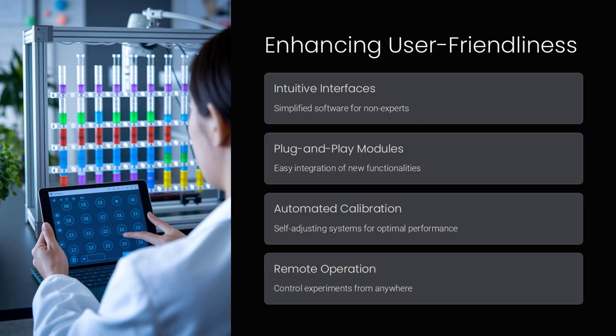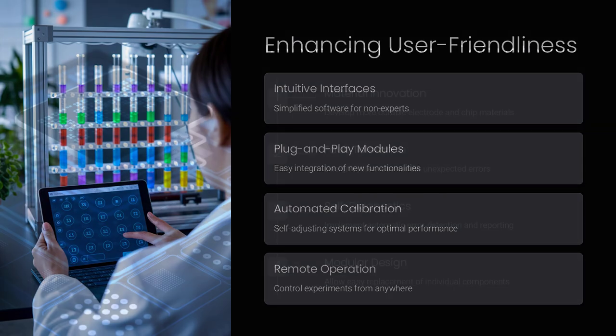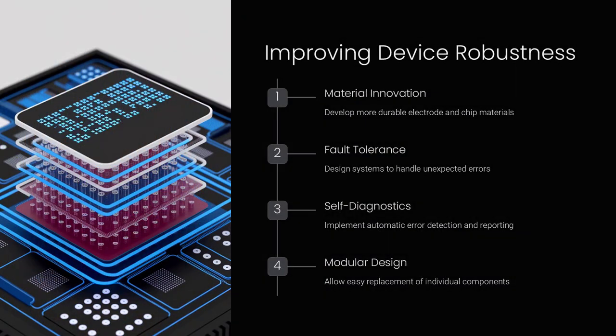A digital microfluidic chip equipped with fluorescent sensors detects changes in light emission as droplets undergo a chemical reaction, providing instant data on reaction progress. Think of it as a smart weather station that not only measures temperature and humidity in real time, but also adjusts your home's climate control system automatically based on those readings.